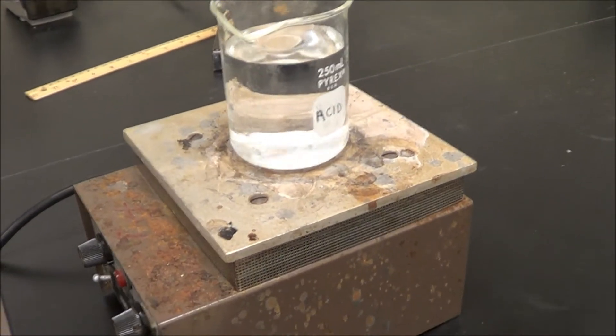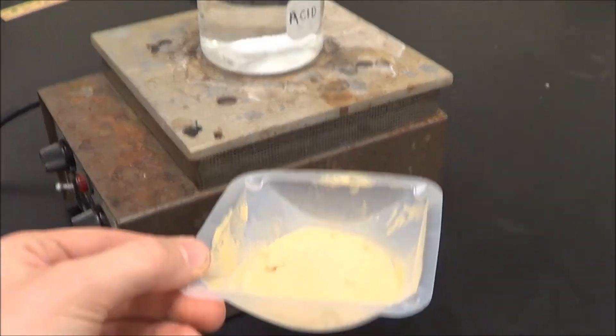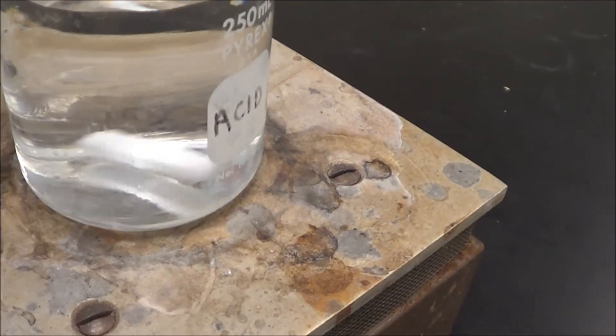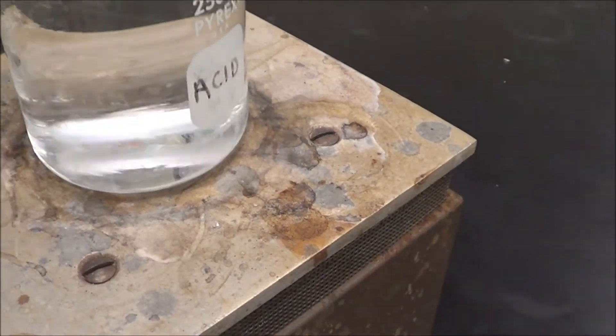Okay, so this is how we make the agar. First here we have some powdered agar and a magnetic stirrer with some distilled water in it.